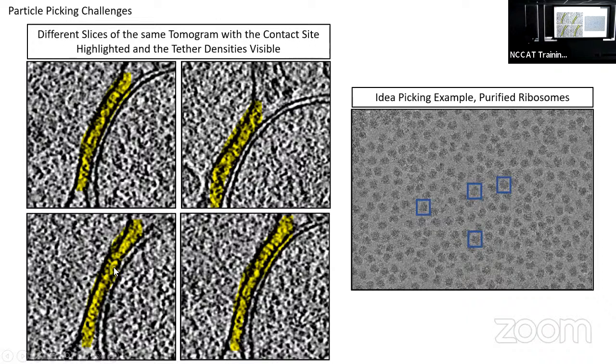One is that you cannot subtract all the other signals, so that's going to affect the alignment. Also, you have three strong membrane signals in your subtomogram, which is also going to drive the alignment. So I was pretty sure that regular approaches wouldn't work, so I just jumped straight into doing it manually. But I tried to impose some geometric information so that I can use it later to align them.